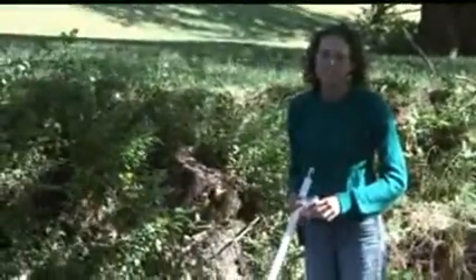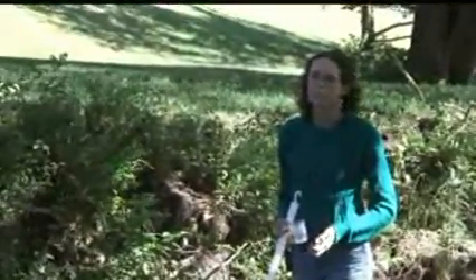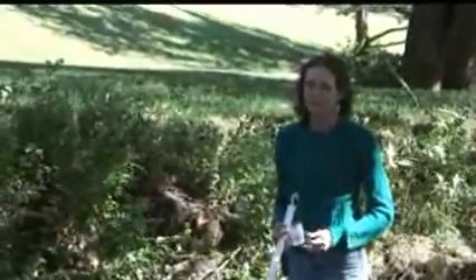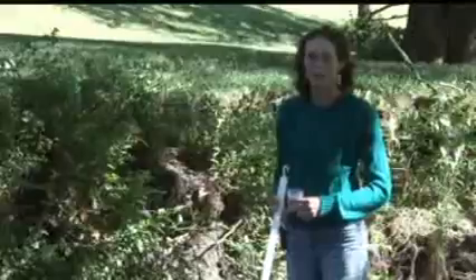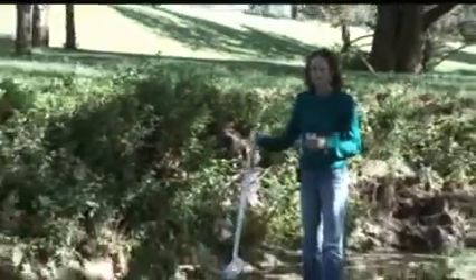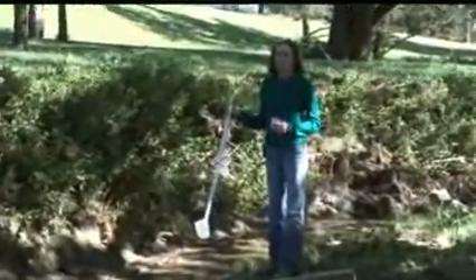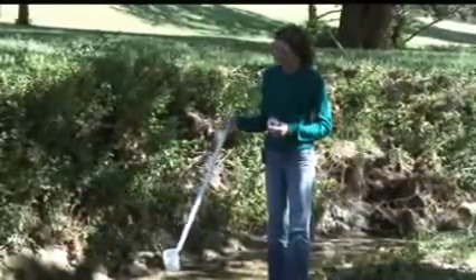Proper sampling procedure helps guarantee that your samples aren't contaminated by previous samples or that you have bad results from sediment entering your water sample. A scoop like this with a three or six foot handle helps you collect the water sample without getting your feet wet or stepping in the mud.